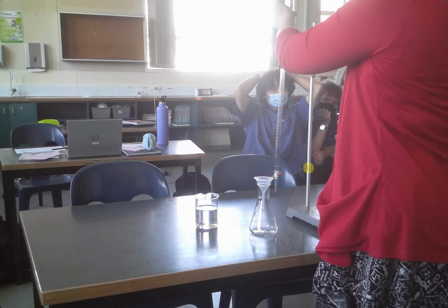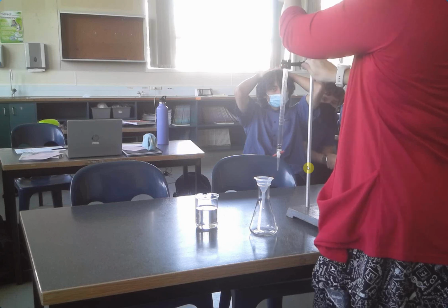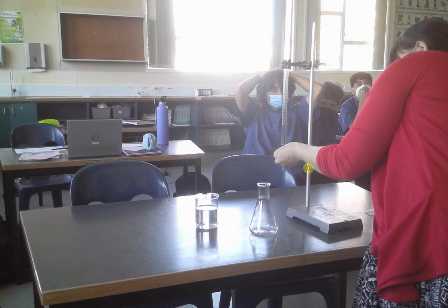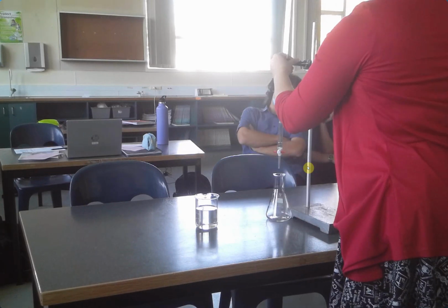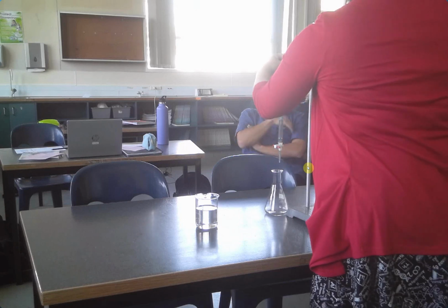I'm going to show you what I mean by how we're going to read it. I'm just putting this up. I am going to make sure the valve is closed so that water doesn't go everywhere. I'm going to put my flask underneath it. I might need to switch this around a bit so you're able to tinker.